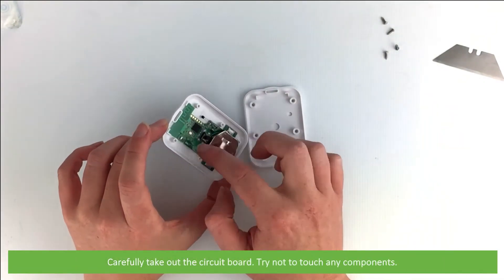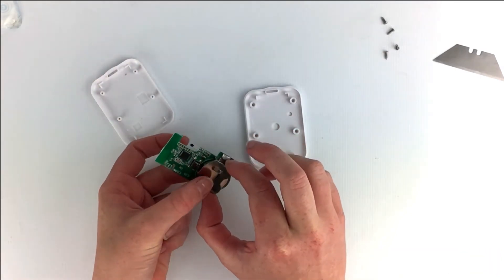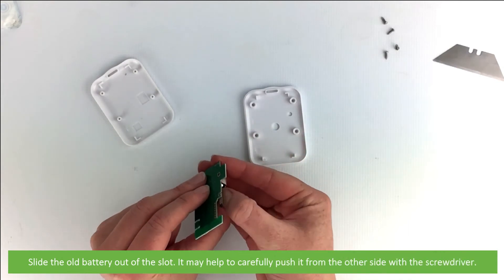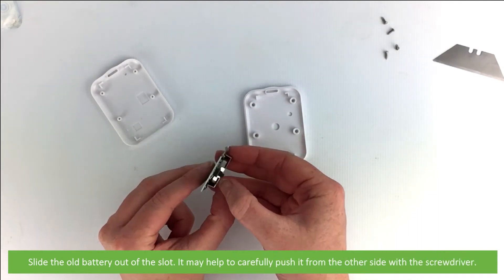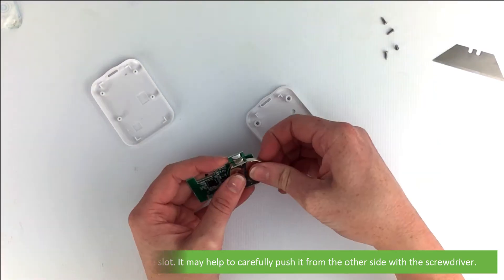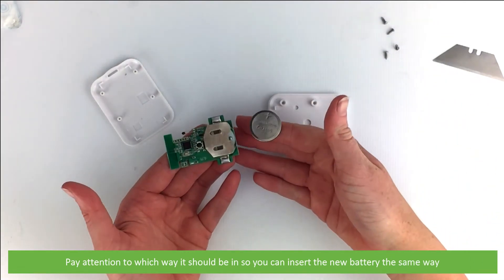Carefully take out the circuit board — try not to touch any of the components. Then slide the old battery out of the slot. It may help to carefully push it from the other side with the screwdriver. Pay attention to which way it should be in so you can insert the new battery the same way.